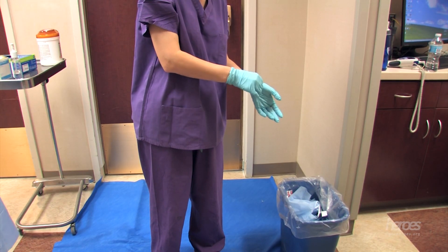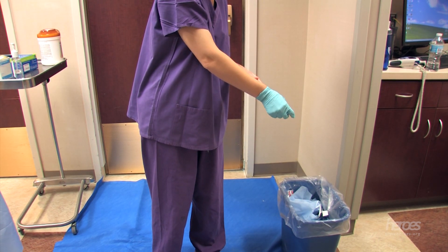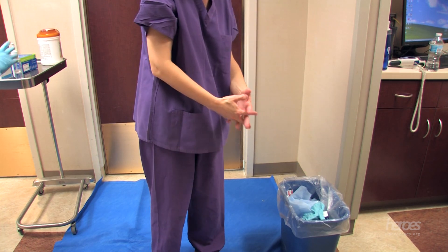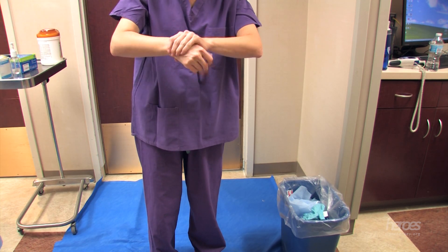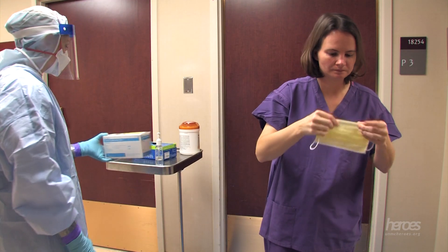The doffer removes the standard patient care gloves using glove-in-glove technique and gently places them in the trash. The doffer then performs hand hygiene and applies a standard patient care mask.